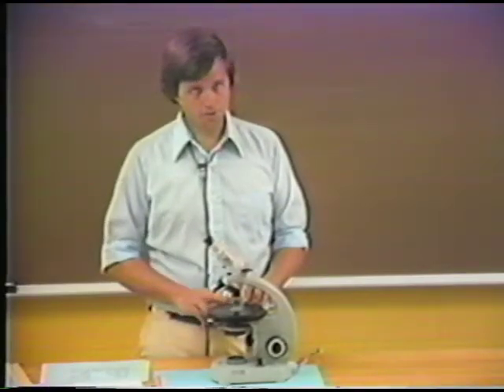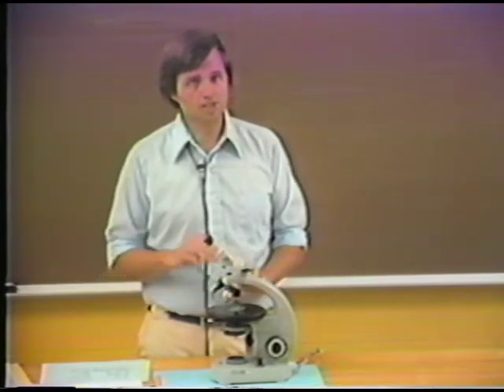And so as the isogyres leave in the northeast direction, it is telling you the direction of the E ray in the mineral. So we use this and we rotate the mineral grain to show the departure in the northeast direction. Then we stop. So we see the isogyres depart in the northeast direction.